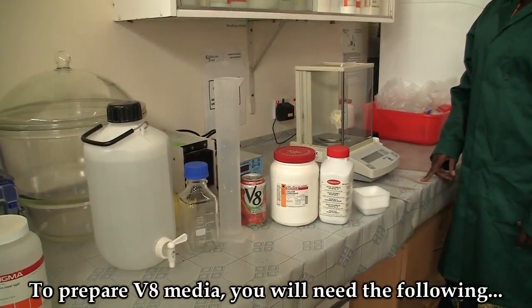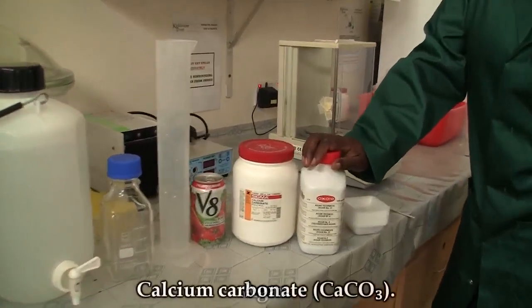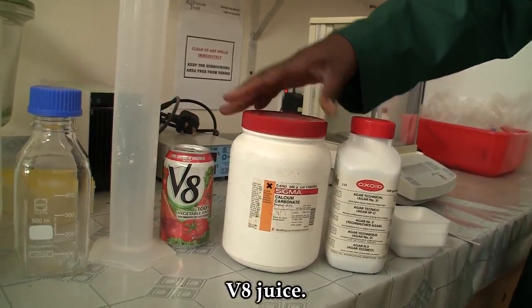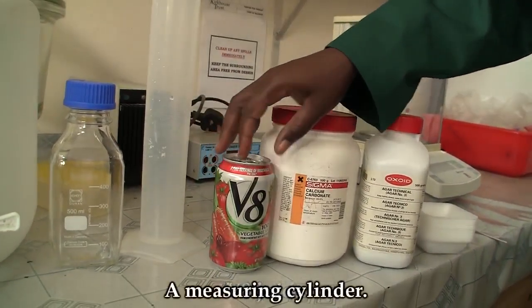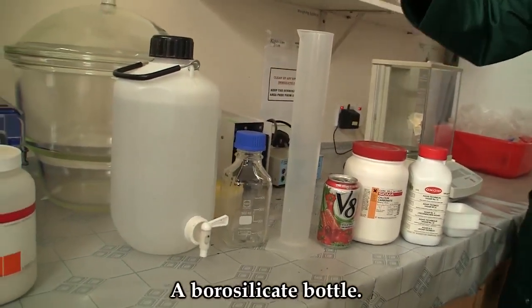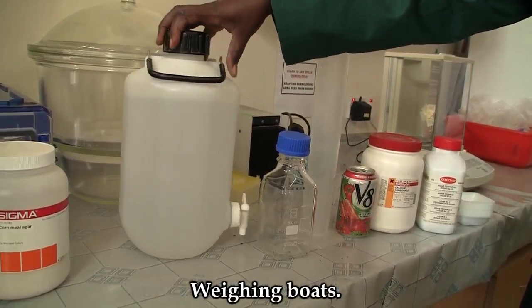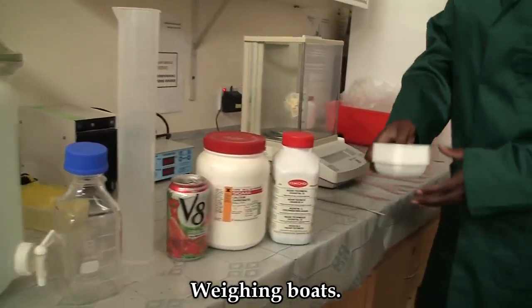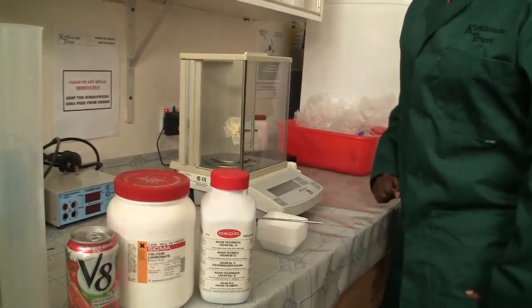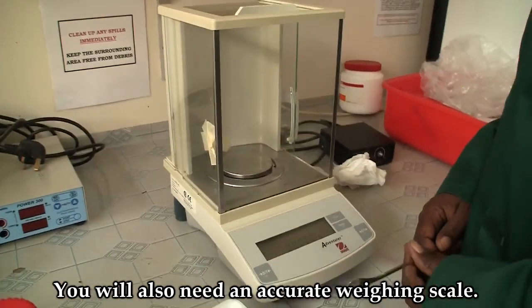To prepare a V8 media, you will require the following: Aga Technico, calcium carbonate, V8 juice, a measuring cylinder, a borosilicate bottle, double distilled water, weighing boards, a spatula, and an accurate weighing scale.